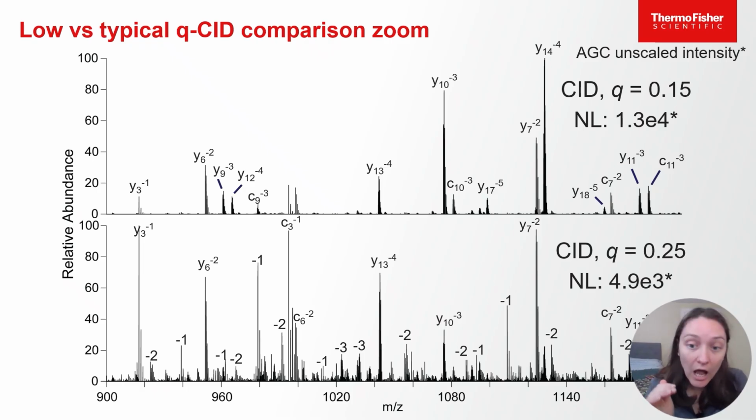Unlike the higher Q or normal value we would use, for example, in peptide work, where we can see some higher value peaks that can be labeled with the C or Y, but there's many other fragments present, which can give very complex spectra that make it hard to determine the confidence.